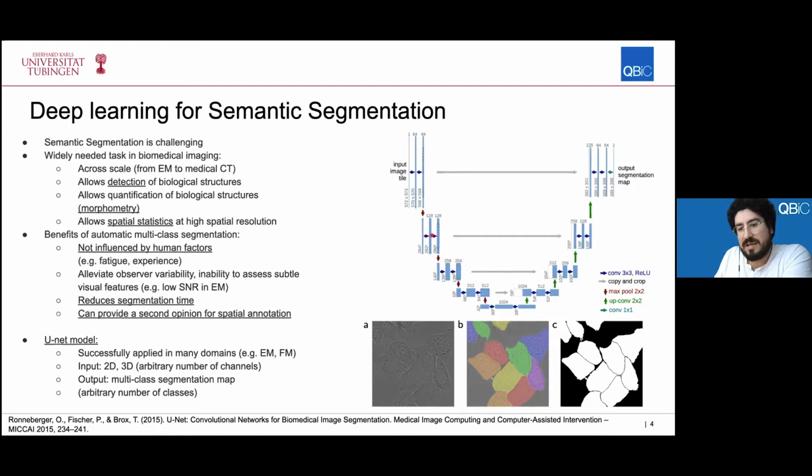So there are computations that happen through these convolutions. You have this downsampling path which detects features, and this upsampling path where the opposite calculations happen. And at the end, you get an output segmentation map, which classifies every pixel in your image. And here is a small example of how the output of a binary classification would look. As you can see, you can detect cells and also measure their shape and spatial organization with this information.